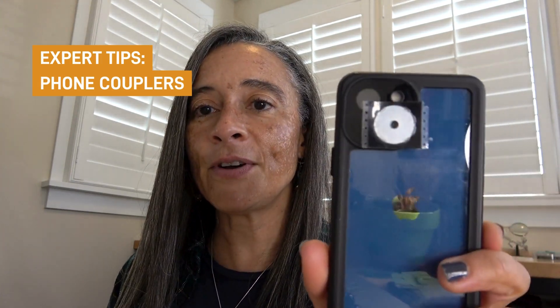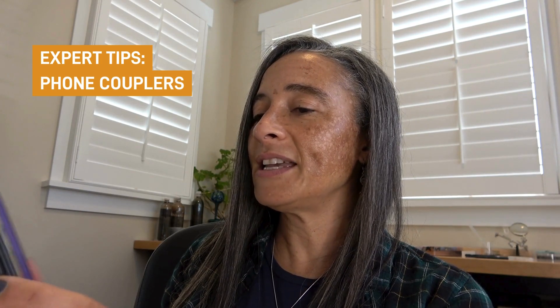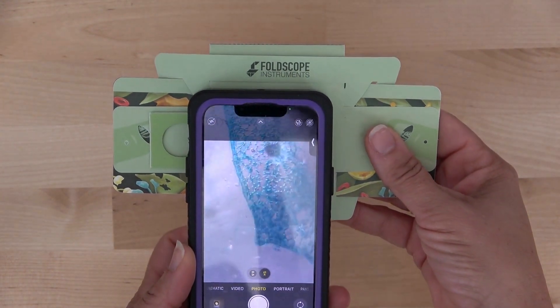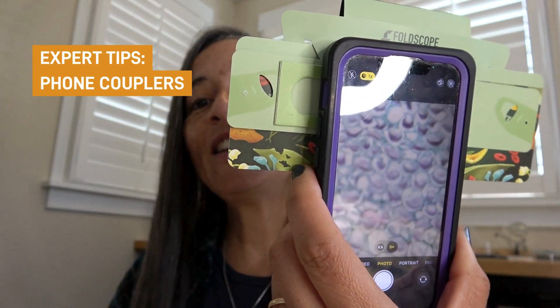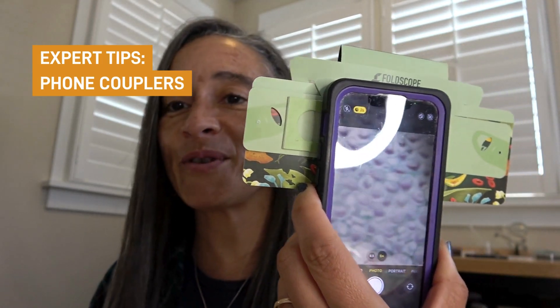So when you take your phone with your coupler and attach it to your Foldscope, you do need to line it up and you will feel it lock into place. Once it does, your Foldscope is on your phone and you will be able to see your images and take pictures and record videos.